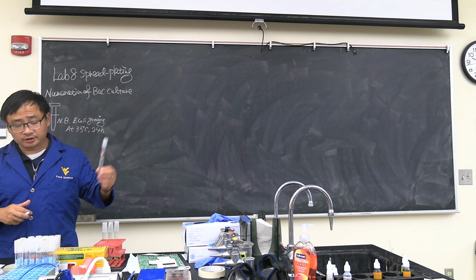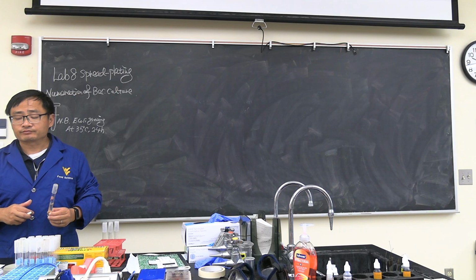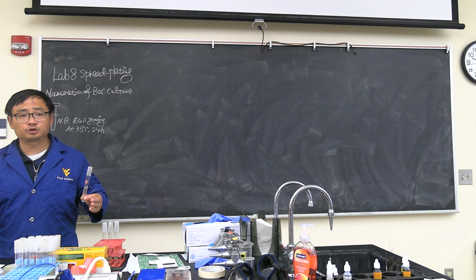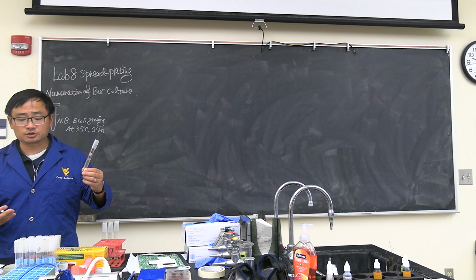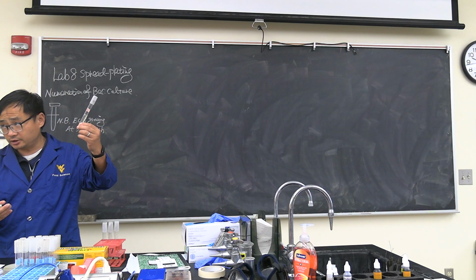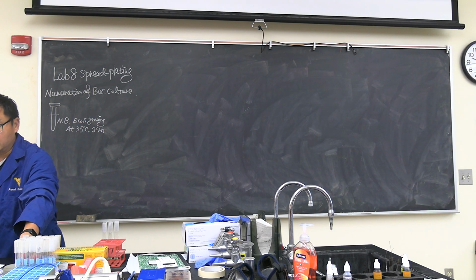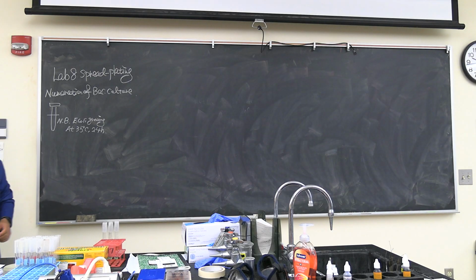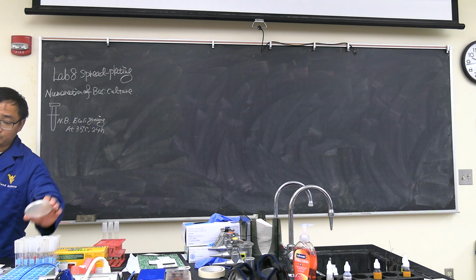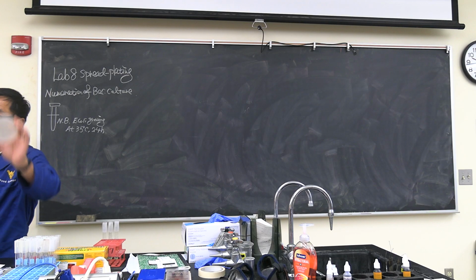We mentioned in the lecture, we said we can use a colorimeter or spectrometer, or we could use some chamber to do the counting. But with those, we don't know live cell or dead cell. Today's method can differentiate live cells and dead cells, which means how many bacteria live in this tube. So how are we going to do it? Lots of people will generate an idea to spread the liquid onto the agar plates.